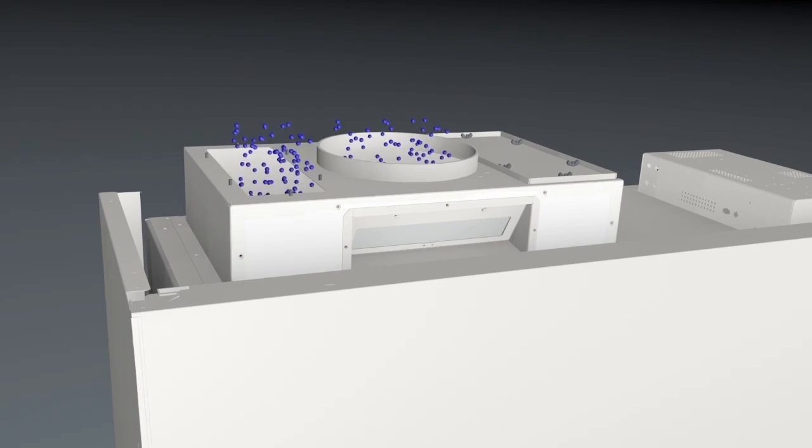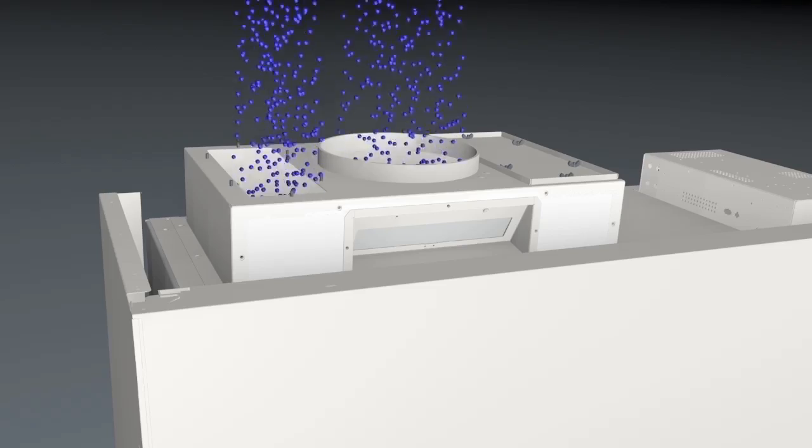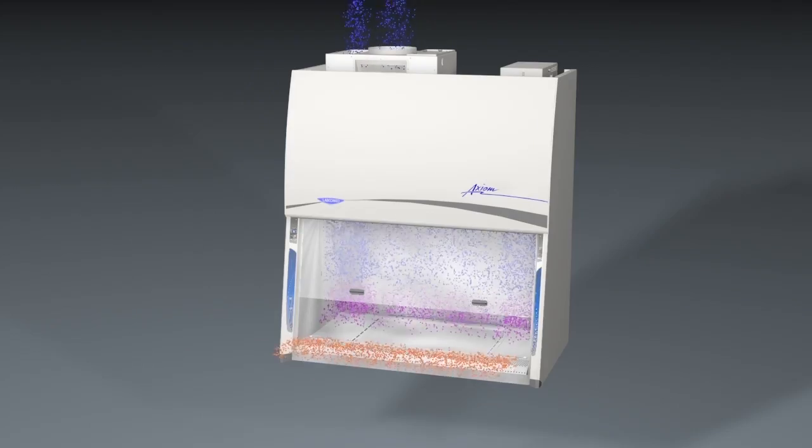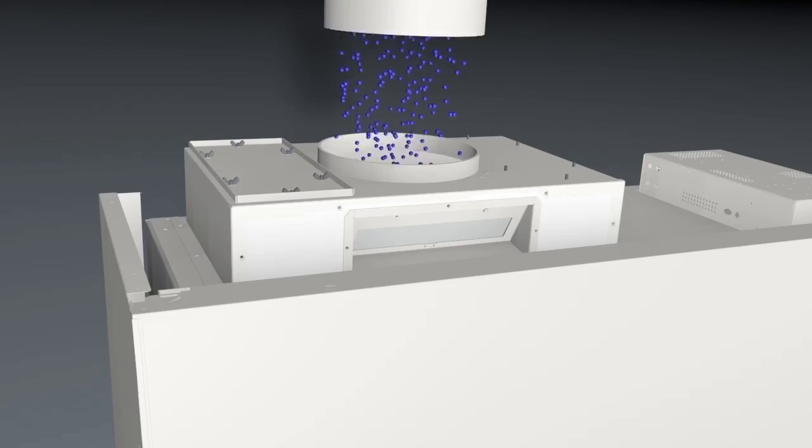The exhaust plenum is designed to alternate pressure based on its installation in either recirculating A mode or exhaust ducted B mode.